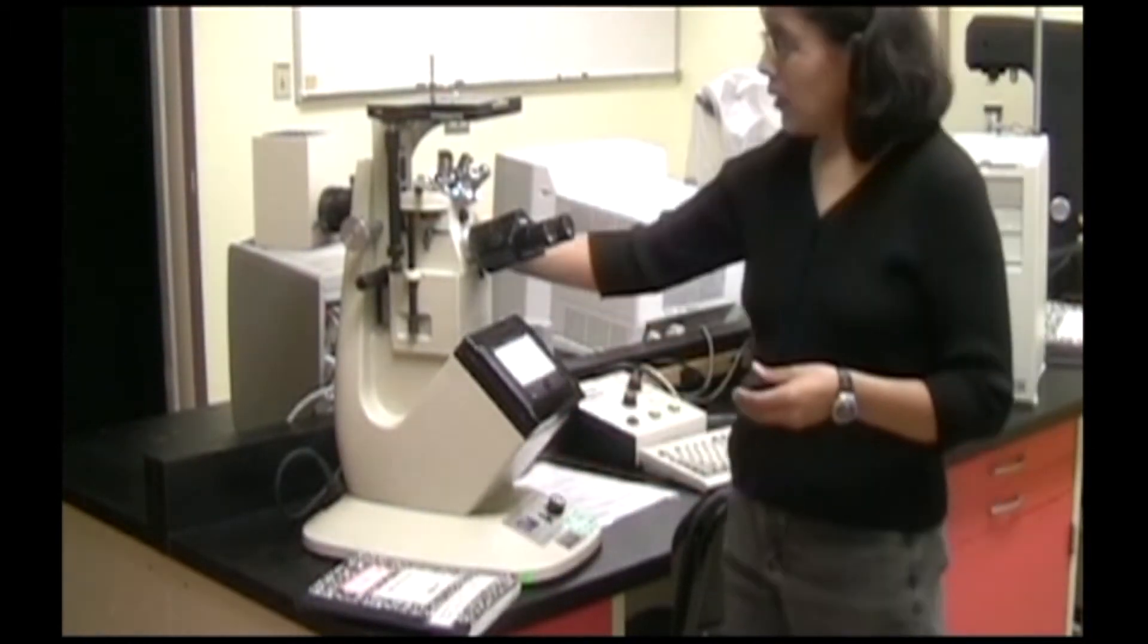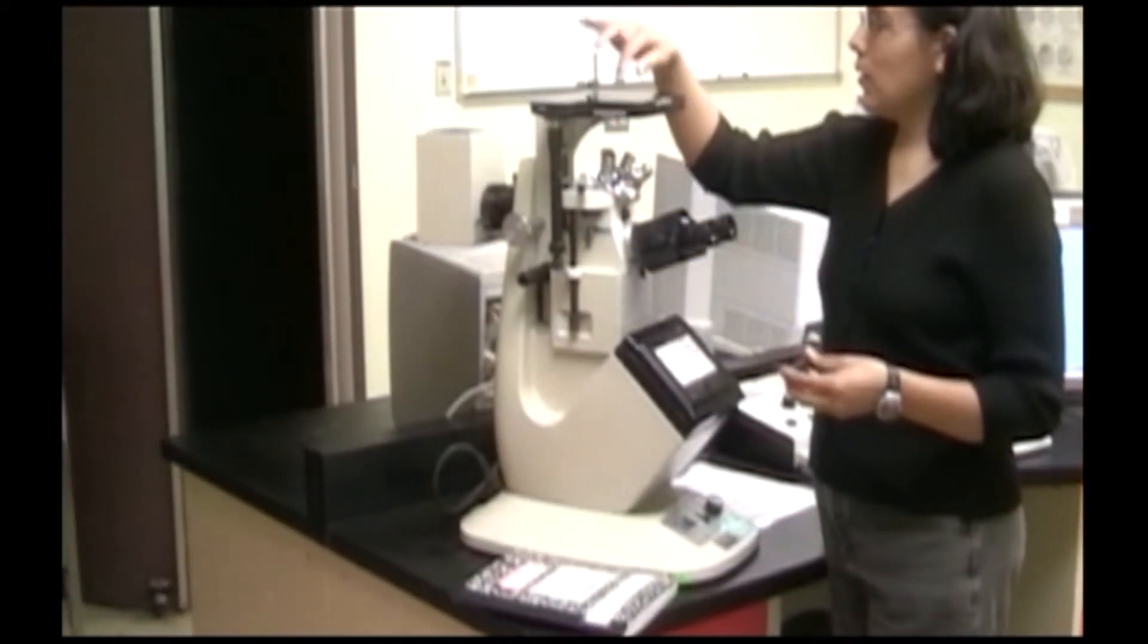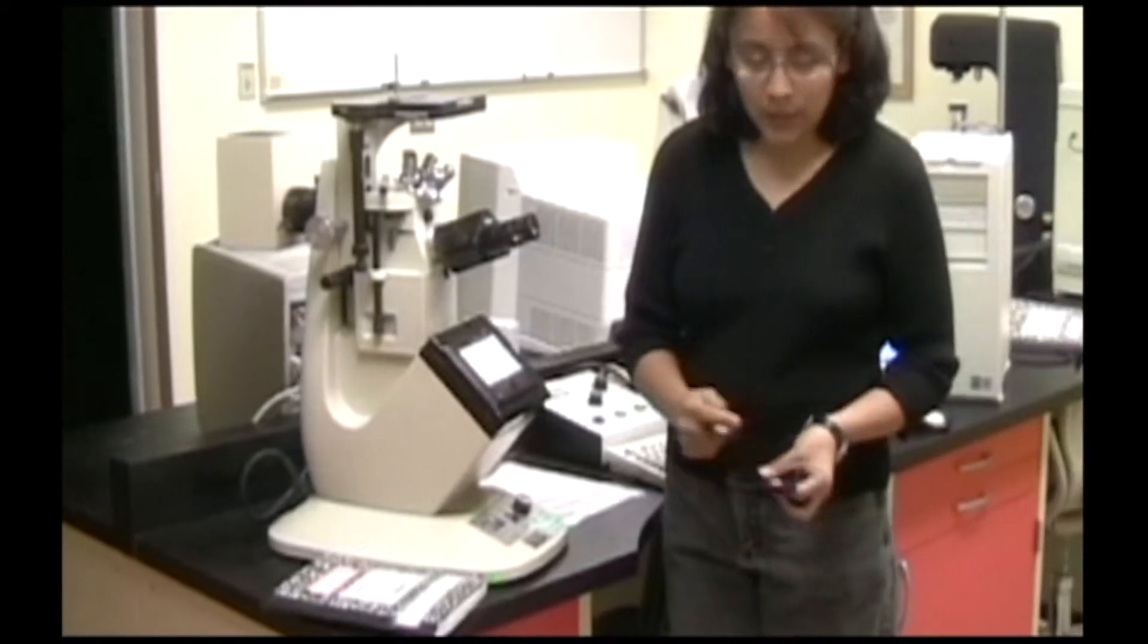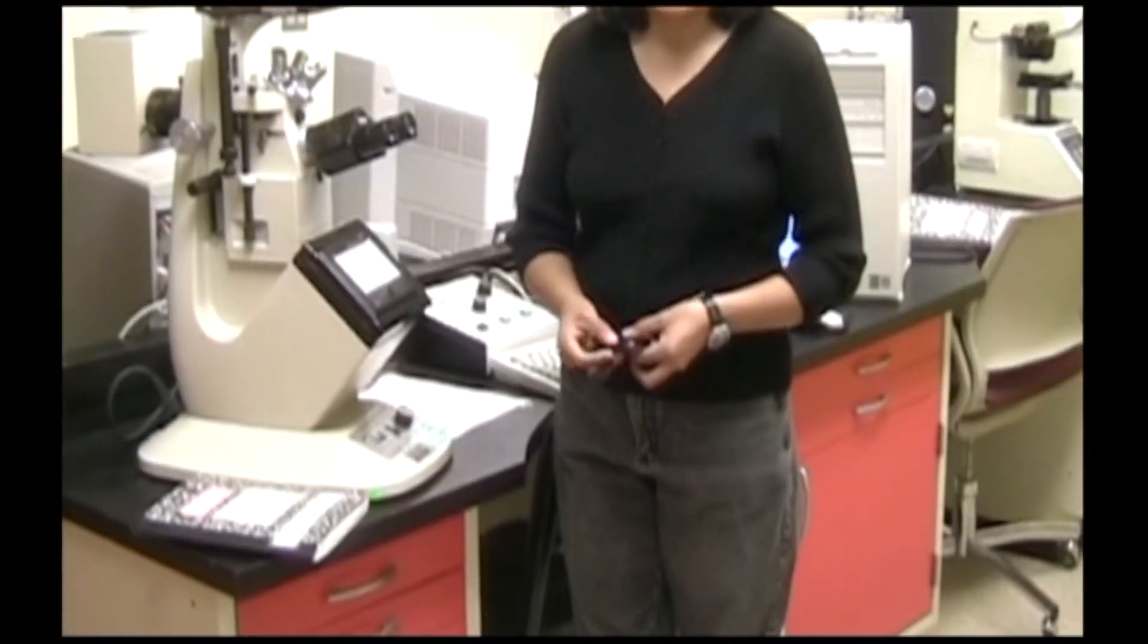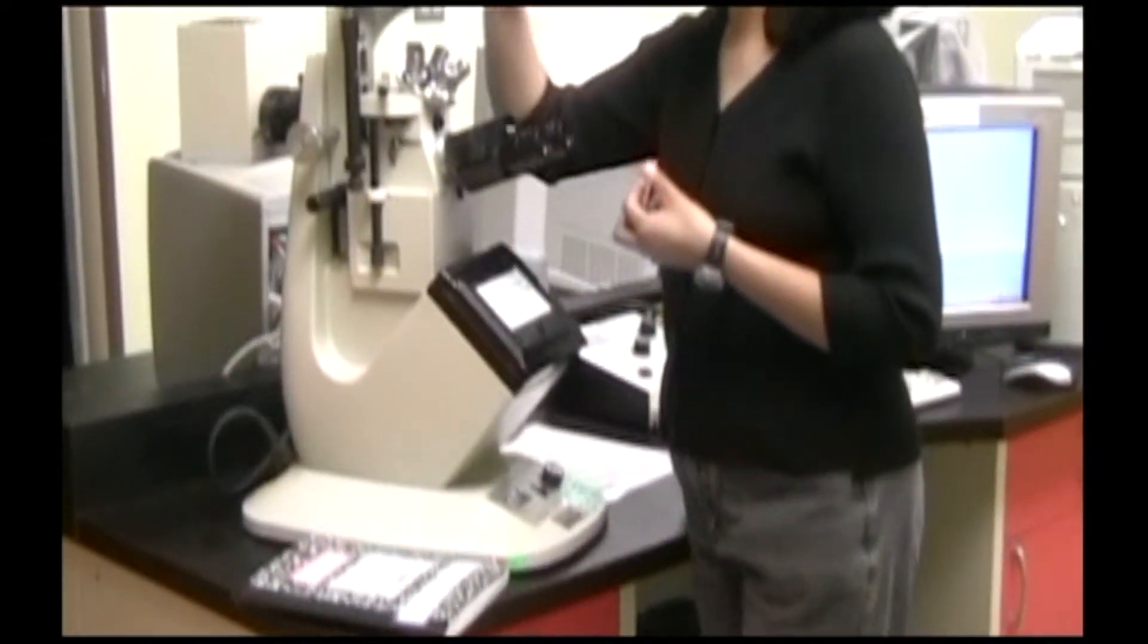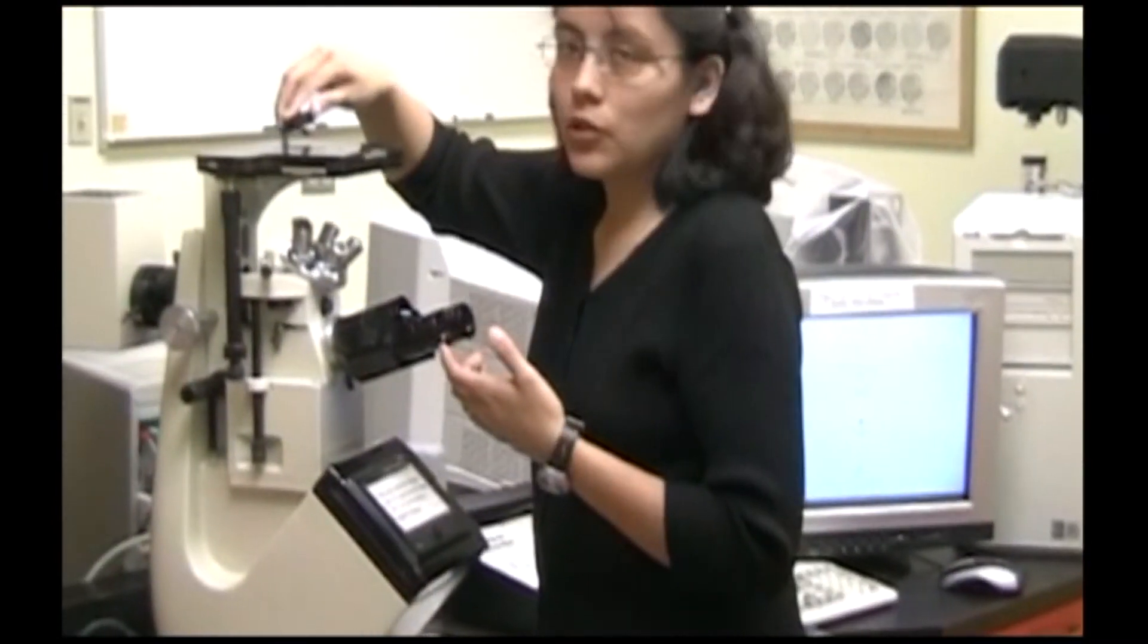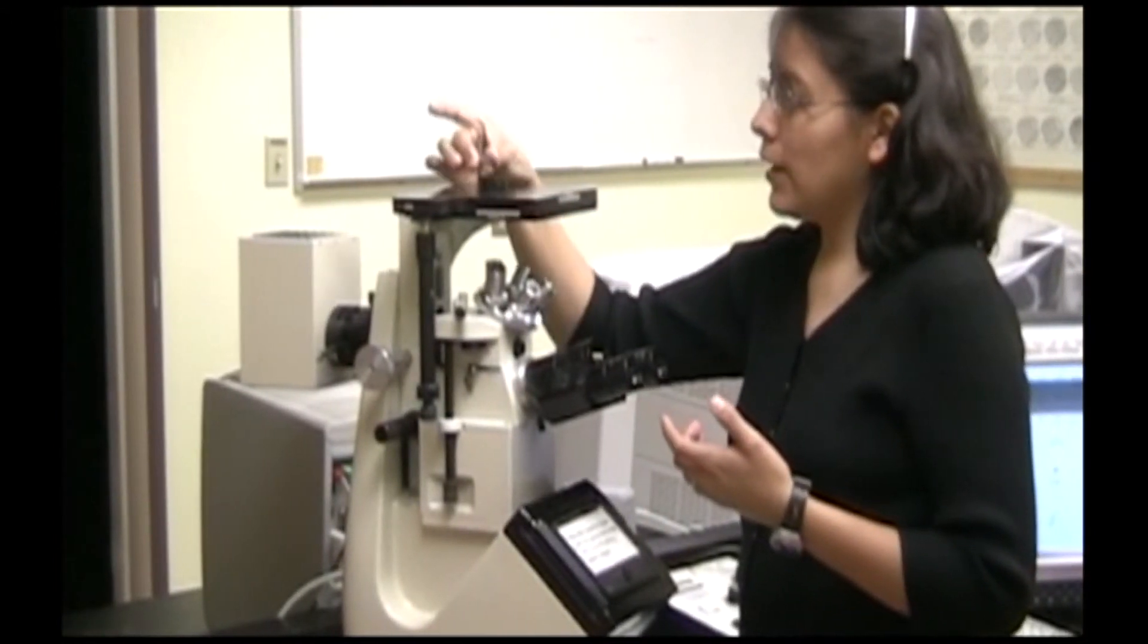Raise the stage all the way up and choose a stage insert with an opening that will show as much of your sample as possible, but not so large that your specimen falls through. You place this concave side down on the stage, and position your sample on top of that and secure it.